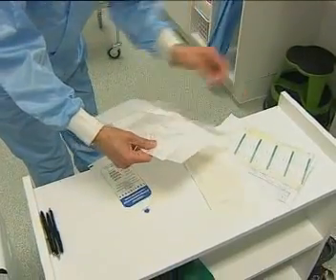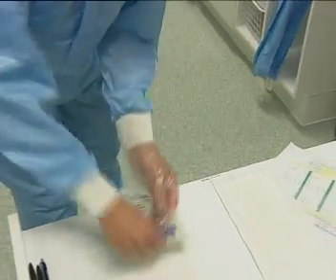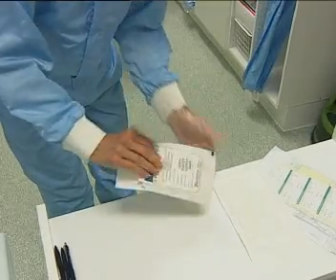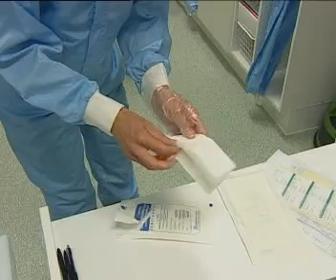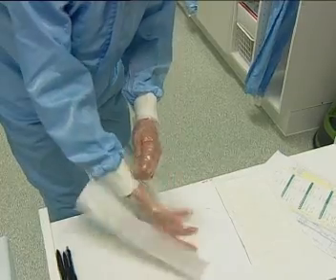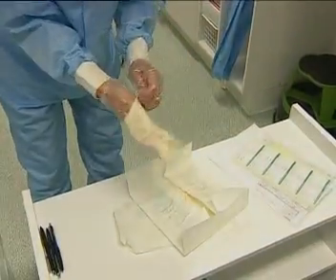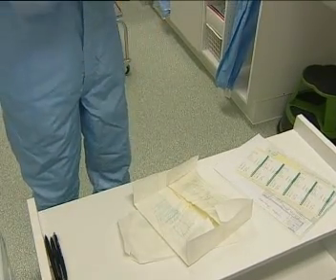Disposable plastic gloves are worn beneath a second layer of disposable rubber gloves. The rubber gloves fit more snugly and cover the cuffs of the bodysuit.